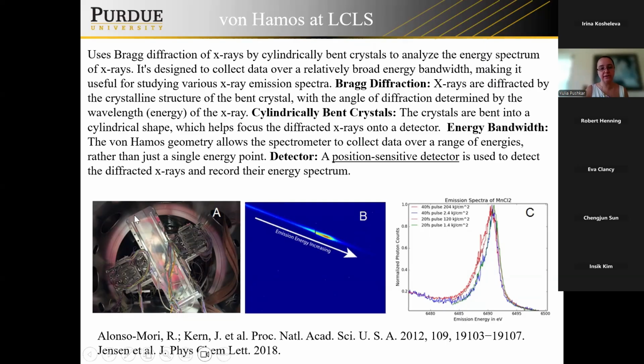Okay, so how was this realized at LCLS? LCLS has another monstrosity, and I worked with it also. It's pretty big, and it has a good number of crystals, and each crystal is also very expensive. I don't know, 12, 20, some good number. So this is a photo from the back. And this is an example of the manganese K-beta line dispersed on the position-sensitive detector. And we did some work there too.